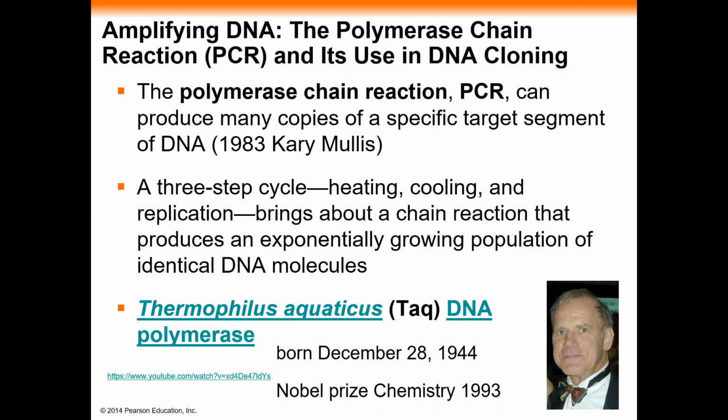And so PCR is simply a way that you can take a segment of DNA and multiply it many, many times over through a 3-step cycle of heating, cooling, and replication. It's simply a chain reaction going through these 3 steps that cause that fragment of DNA that you're interested in studying to be copied, so that if you're starting with just one fragment of DNA, at the end of an entire PCR reaction, you end up with about 1 billion copies of that fragment. And as I said, this only takes several hours to do.